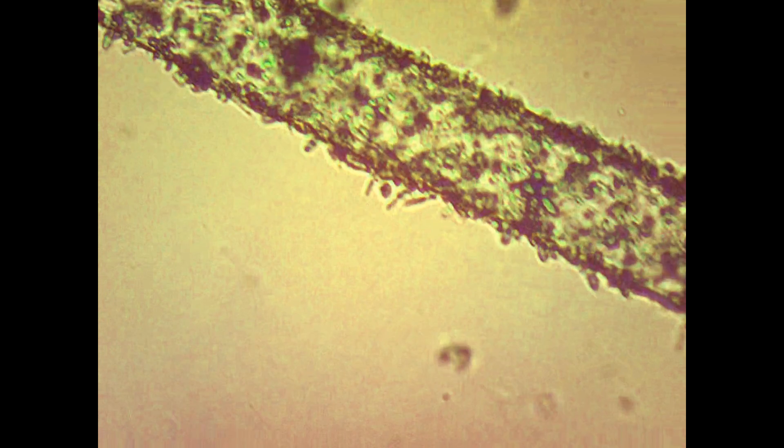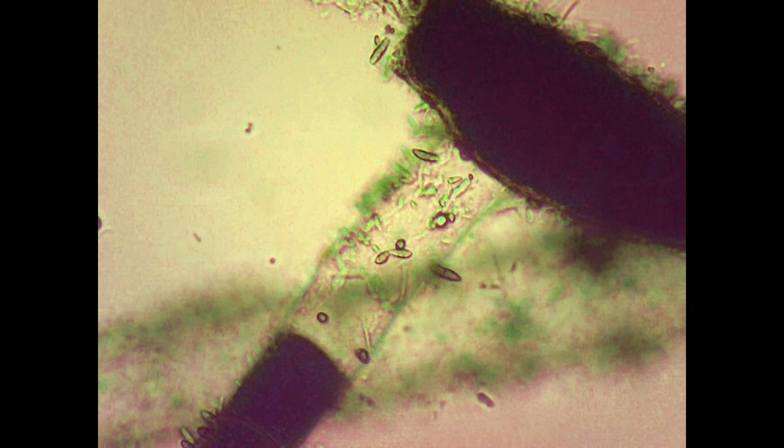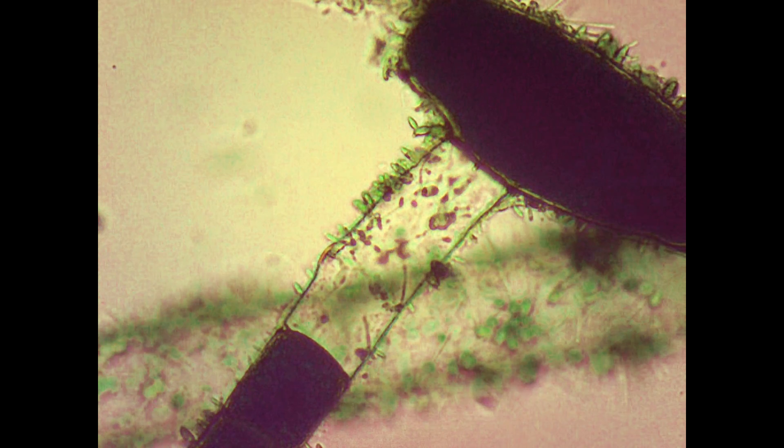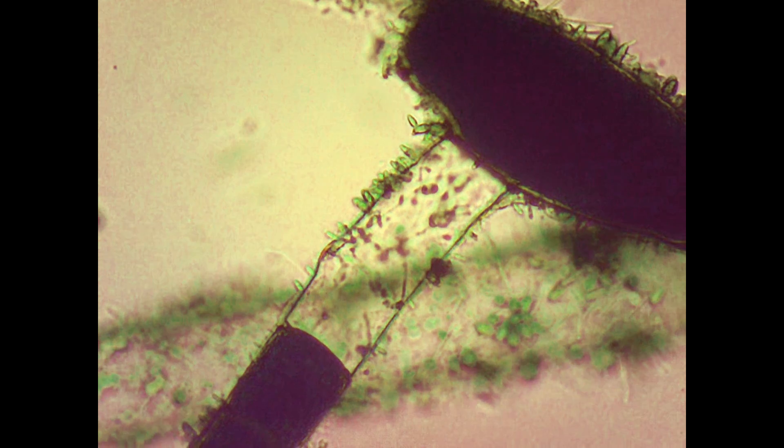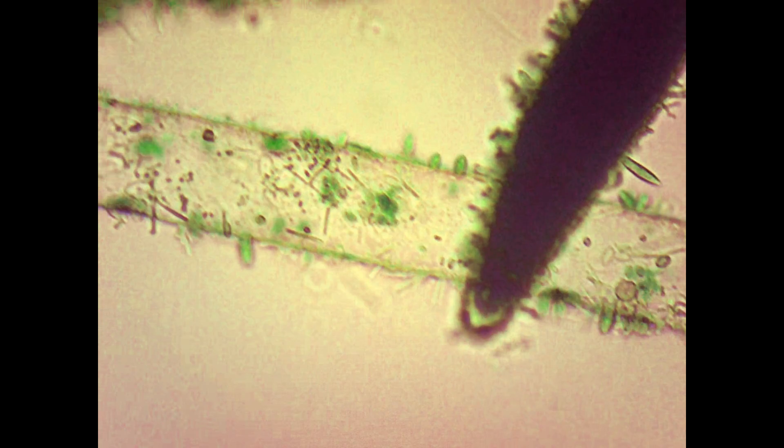As we cruise around at a higher magnification, we can get a better view of the various structures inside of each cell. We unfortunately don't have enough resolution to determine what every structure is, but it would be fair to say that all the small green spheres we see are chloroplasts, which are the structures where photosynthesis takes place.